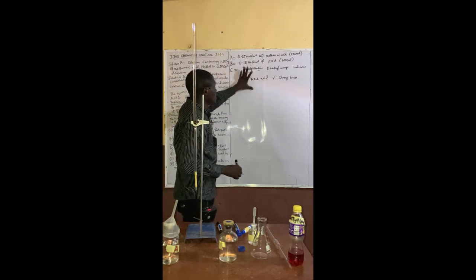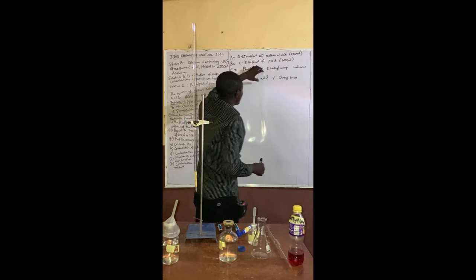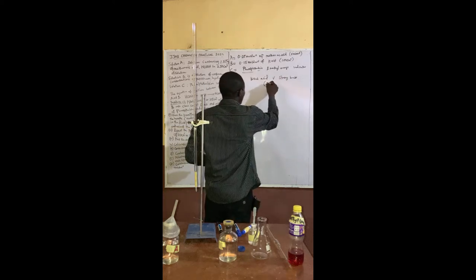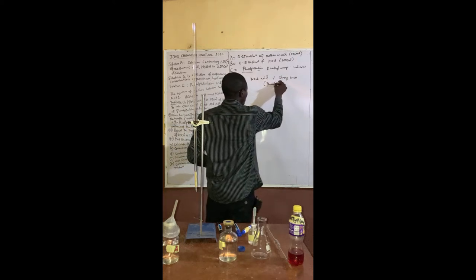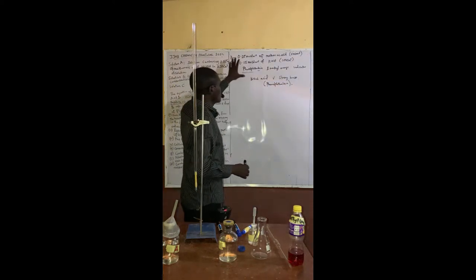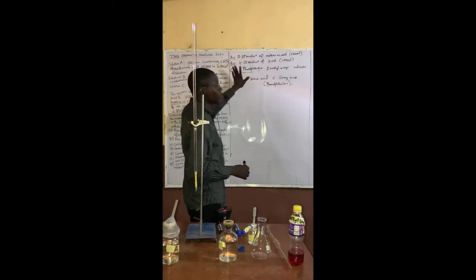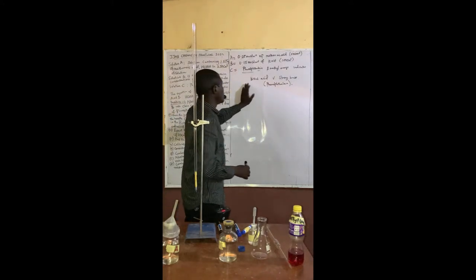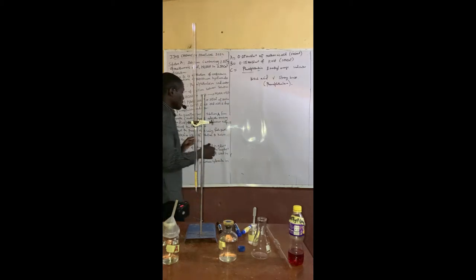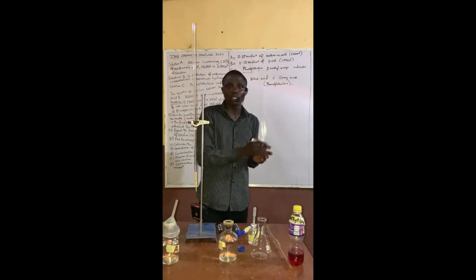So in my lecture, this is going to be a reaction between a weak acid and a strong base, and phenolphthalein is suitable for the titration. These are the conditions of the apparatus and reagents provided for the titration experiment this year. Based on this, I'm going to perform the experiment, considering the two ways by which this question can be set this year.